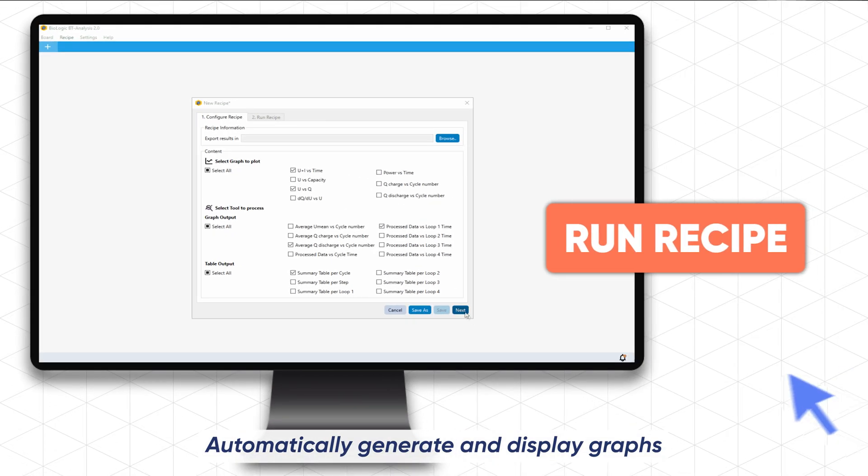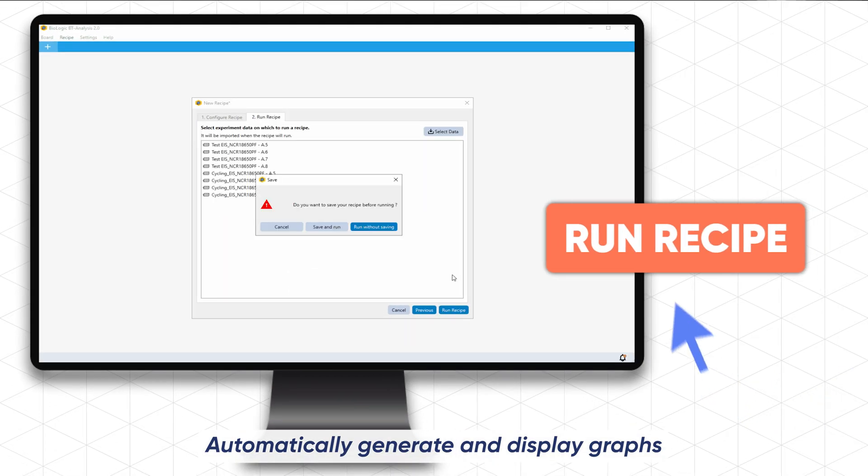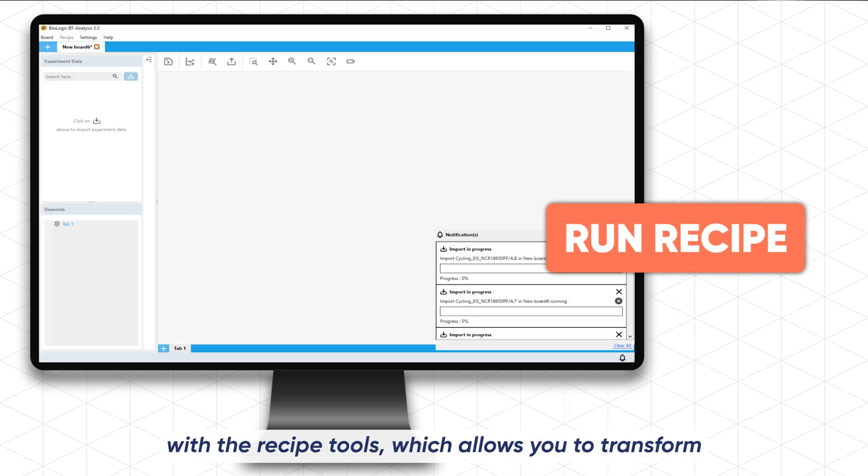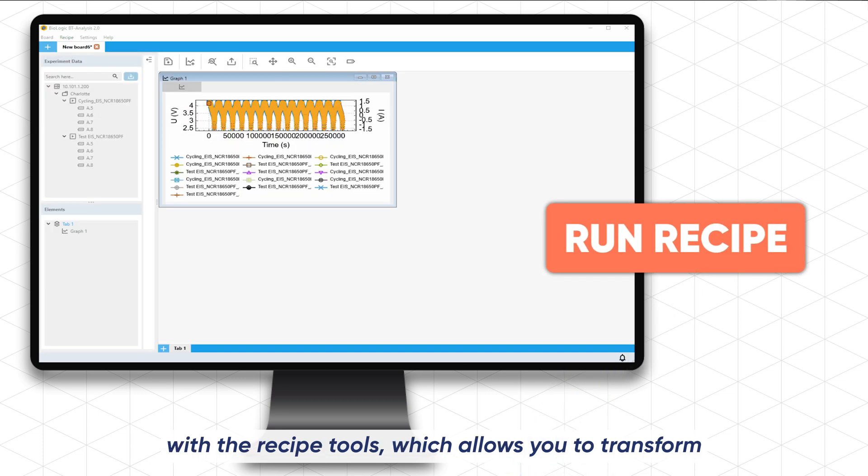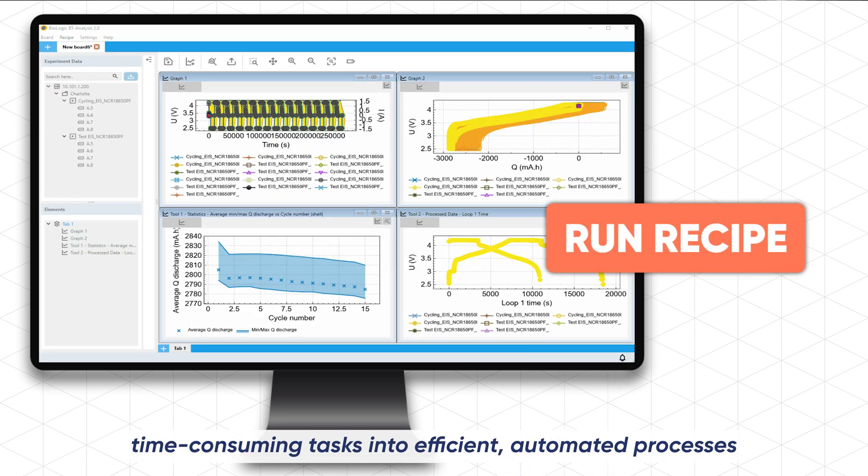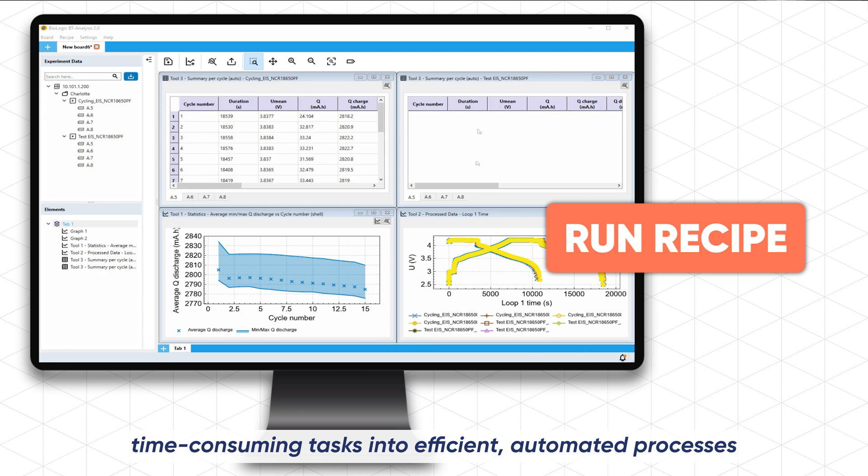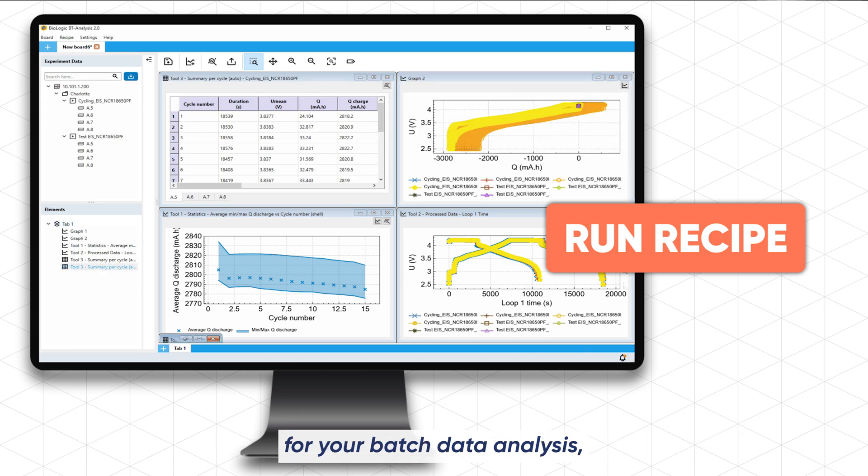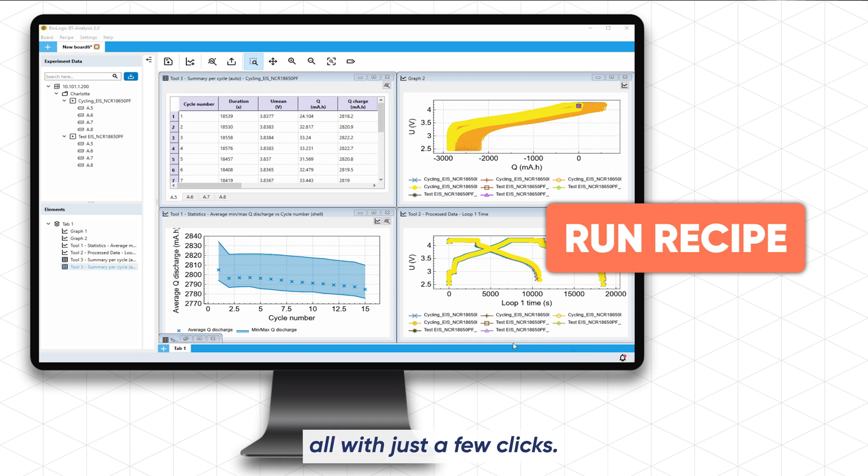Automatically generate and display graphs with the recipe tools, which allows you to transform time-consuming tasks into efficient automated processes for your batch data analysis, all with just a few clicks.